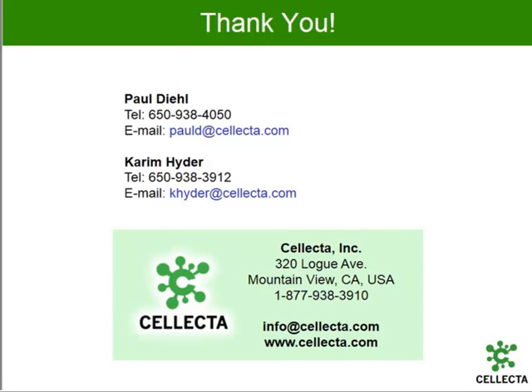But with both shRNA and sgRNA in this type of screen, the short answer is that you have multiple sgRNA or shRNA targeting the same gene. And so you're looking in the results for ones where you have multiple hits on that gene. And that's, as I showed you here, where we had at least 4 different sgRNA or 4 different shRNA that are giving us significant depletion. Those are the ones that you consider positive. If you just have one lone sgRNA or shRNA and the rest of the ones targeting that gene don't give you any signal, then it's more than likely that you're getting an off-target effect there.